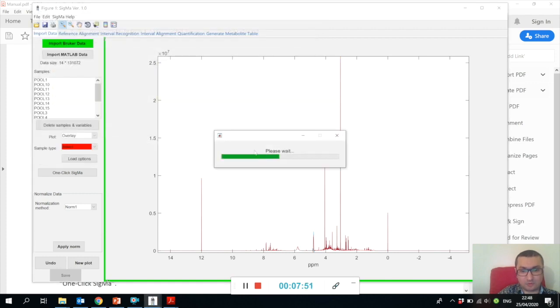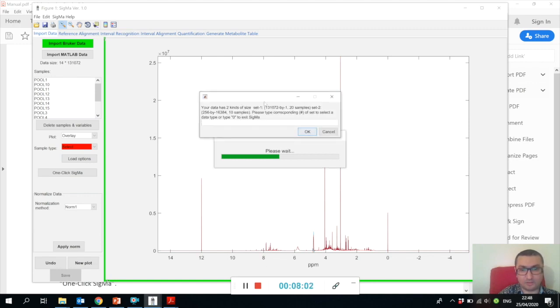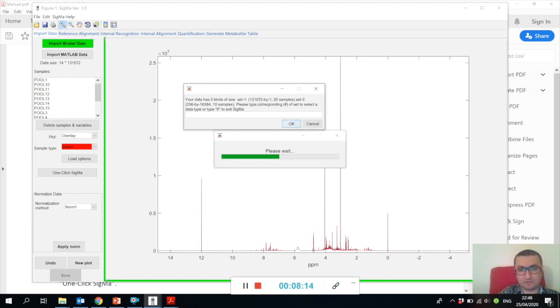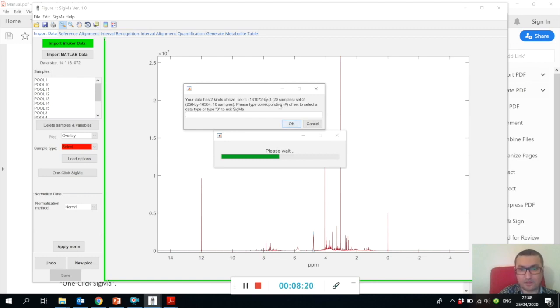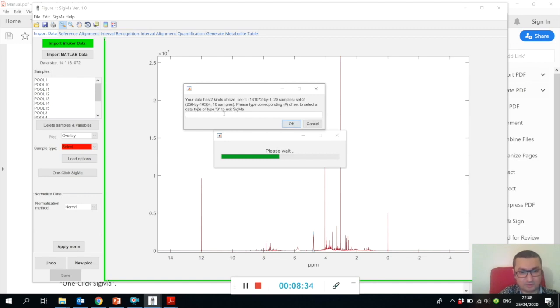I would like to mention that Sigma only processes one-dimensional NMR spectra, not two-dimensional NMR spectra. You can see now we are trying to open incompatible data and we get a message saying your data has two kinds of size. Set one data has 131,072 by 1, which means it's one-dimensional spectra, and we have 20 samples of those. Set two samples is 2D data - this is a JRES spectrum, 256 by 16,000. In this case, we want set one, so you just type one.